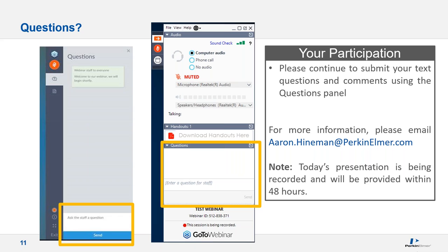Huh, that's interesting. So they interfere on each other, I guess is the question. For example, if we're looking at copper and phosphorus, we have to use the 214 line for both of them. In that case, depending on how much the overlap, you can set your peak, where you determine your points per peak, and you could kind of move them off the top of the peak. So maybe you're looking at the side of the peak where there won't be an interference from the other peak. I've done that a couple times.